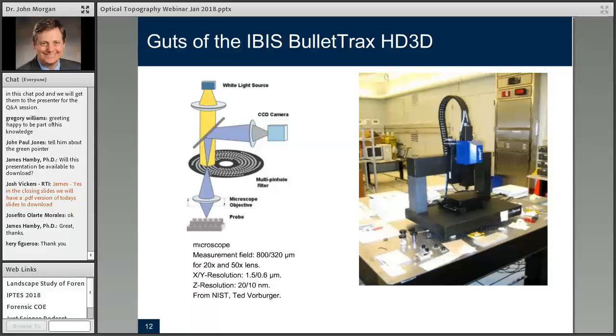There are going to be some differences, just from the fact that you're using an optical technique to find out what that depth is in the object, and there are going to be some errors associated with that. Some of those are systematic errors, some are analytical errors, and some are errors associated with how you manipulate the data. We'll talk a little bit about that in some detail here so you can get some insight into how that works. But the bottom line is that with any kind of microscopy system, you're making a representation of the surface, and you have to assume that there are going to be artifacts.